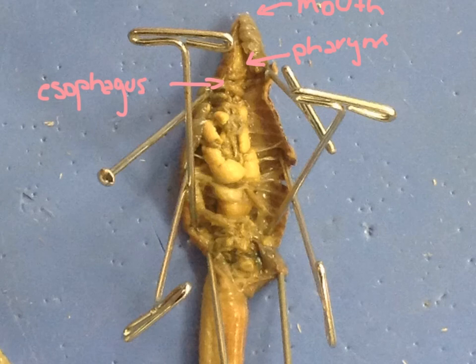The next important piece is the hearts. These are the hearts, also referred to as the ring vessels. They're called ring vessels because they band around the pharynx. They help pump blood between blood vessels. The next important part is the crop. The crop stores food.